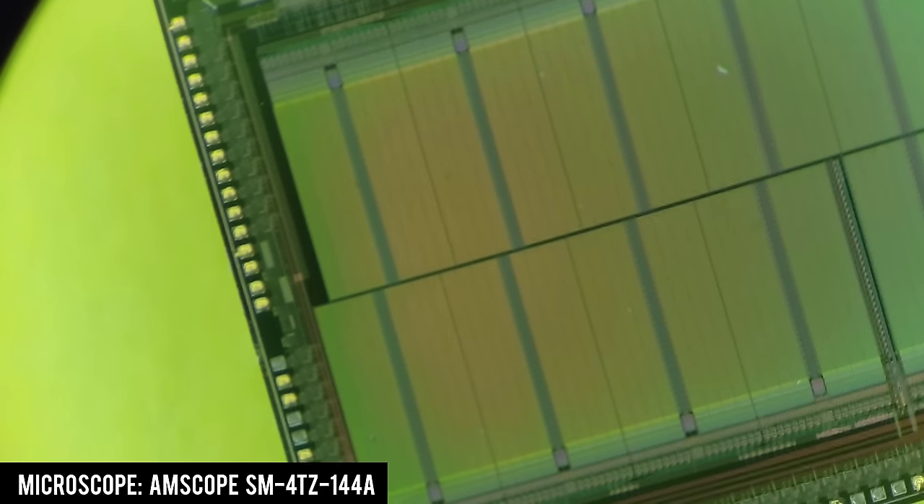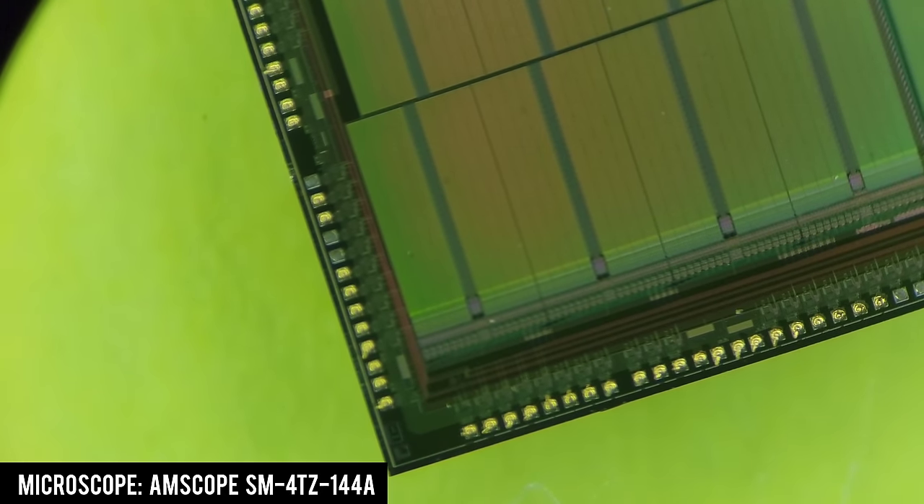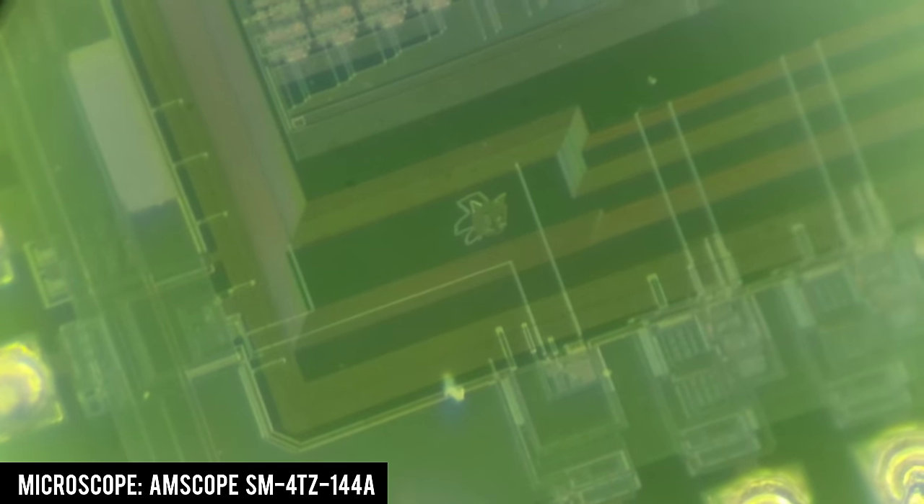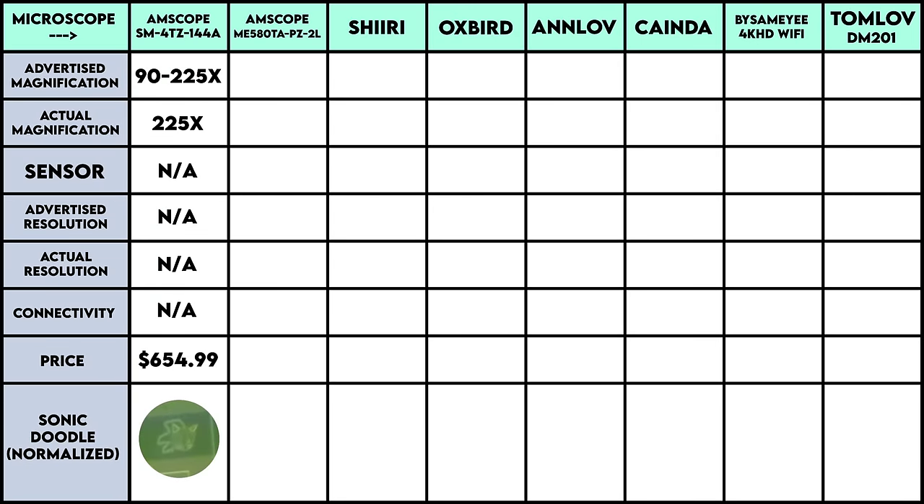For the second test I'm using the ADS-P2181 chip which has a doodle of Sonic on it — I'll photograph Sonic with each microscope. Filling in the table is pretty straightforward: the maximum magnification is highly dependent on what lenses and eyepieces you use. The SM-4TZ also doesn't come with a camera, so that's an additional cost to consider. In the photos and videos so far I've been using my Samsung cell phone looking through the eyepiece, and that will also be true for the next microscope.